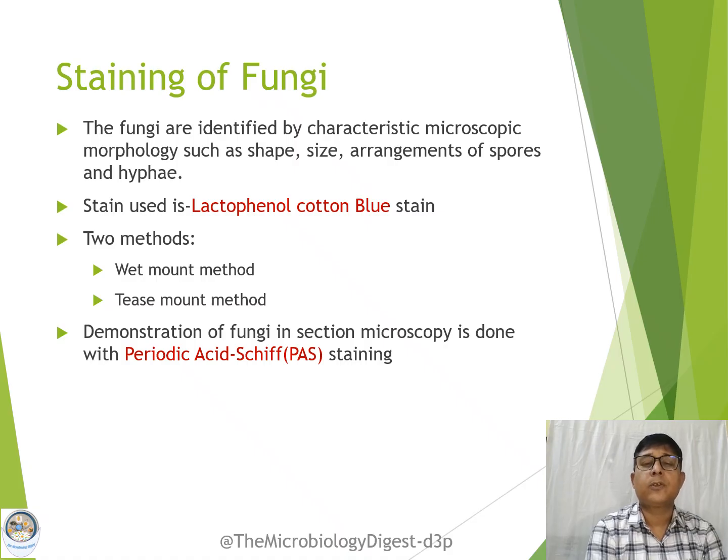Then if we want to demonstrate fungi in a tissue section, we have to stain with the help of periodic acid Schiff staining. In short, it is called PAS staining. So this is for demonstration of fungi in tissue sections.